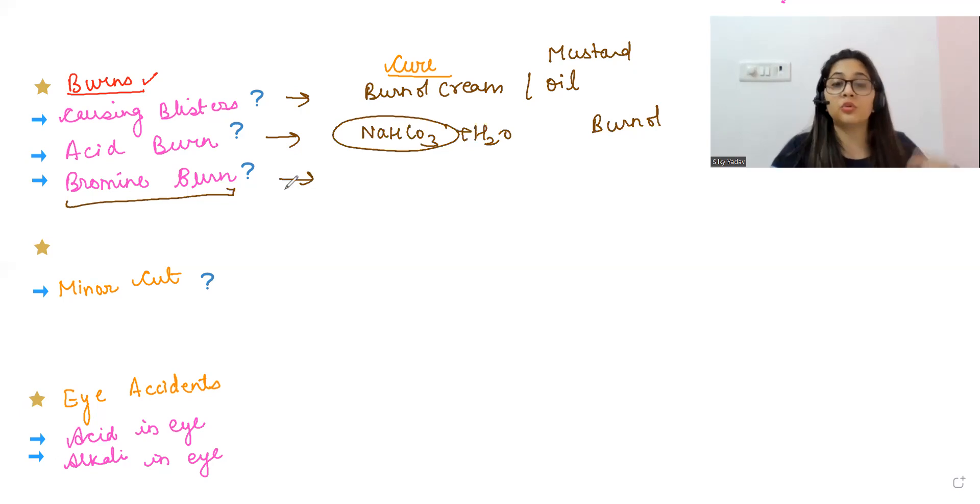Now if it is a bromine burn, you cannot use the same thing which I've told for the acid burn. A simple burn which was causing blisters, we used only the burn-all. If it is acid burn, we used sodium bicarbonate solution and after that applied the burn-all. The third one is if you've got a burn by bromine, there you will use the ammonia solution to properly wipe it off.